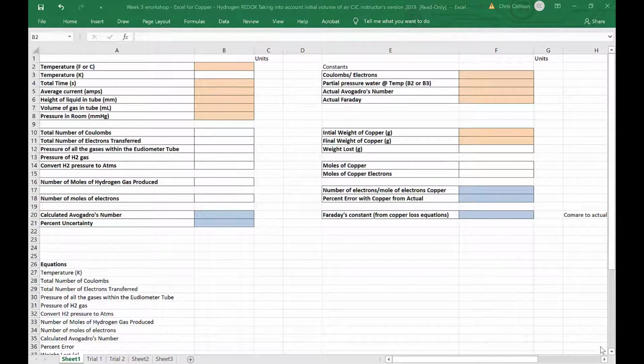So here's a standard Excel spreadsheet that you're going to be provided with, and it's not filled out at all in the version that you're seeing in front of you. What I'm going to ask that you all do is to write down the equations that are important in this area around here. And so there are certain cells that are left available to you. We're going to try and fill this in step by step.